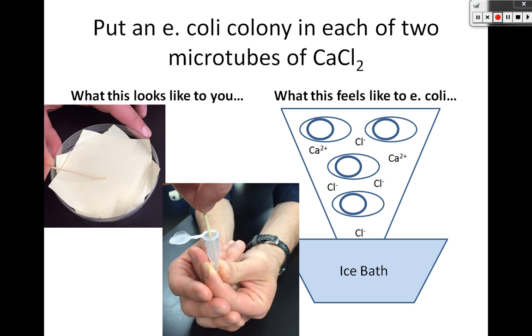So here's what we're doing, and again, the written directions give you far more detail, so I would almost have those out so you can follow along as you're going through what the pictures look like and what this feels like to the E. coli. And many thanks to our UW observers, Mr. Putman and Mr. Taylor, for helping out with the pictures.